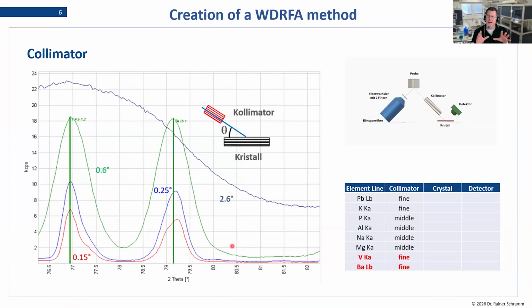We always have to keep in mind this is only one sample. When we have multiple samples where the concentration changes, the peaks change in height and position. We have to think about that when we're looking at our goal at the end, to have a performing analytical method.